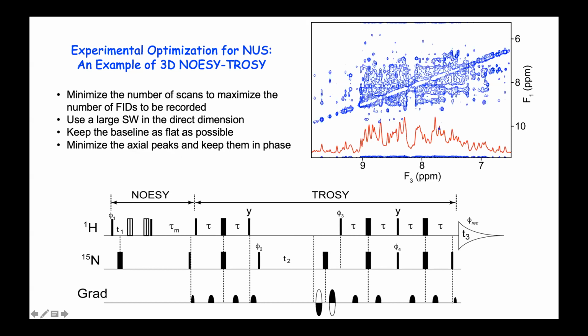Okay, and of course, if you could keep the baseline as flat as possible so that you don't need baseline correction, that would be the best. And that involves good water suppression. For a cryoprobe, it's not easy sometimes. For us, we're lucky that we have a few cryoprobes that have triple axis gradient, XYZ gradient, so that we could use, for example, these decoding, encoding pulses. If we set them to use all the XYZ gradients, the water suppression usually is very good.